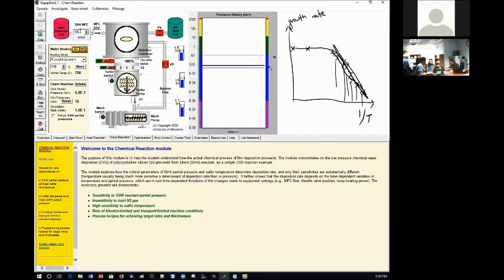Let's do the following. Come here, give a little bit of gas. Instead of 100, let's say 150, and then let's observe the deposition rate change. Okay, it did jump, right? So what happened? I gave a little bit more gas, so it did elevate the deposition rate a little bit, because I am now presenting more gas.